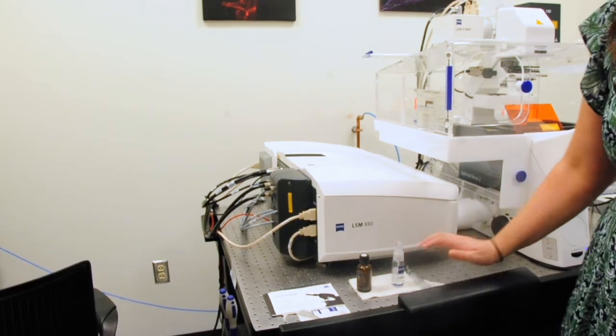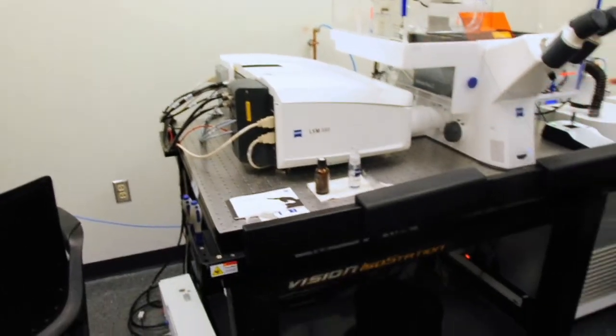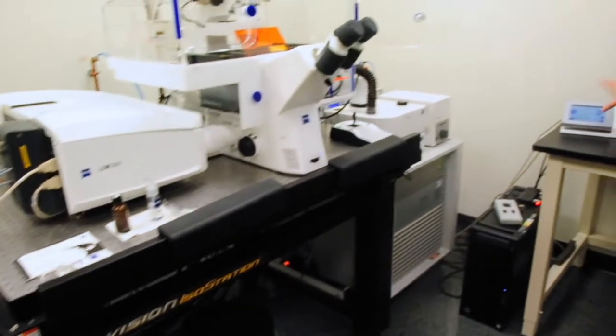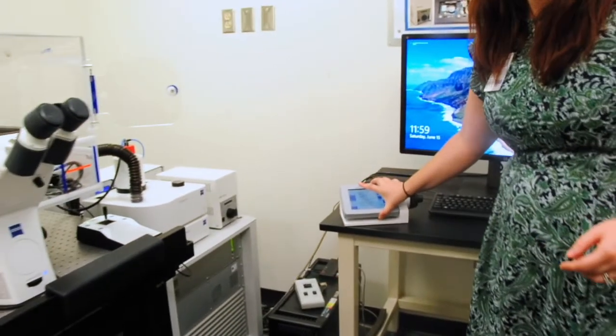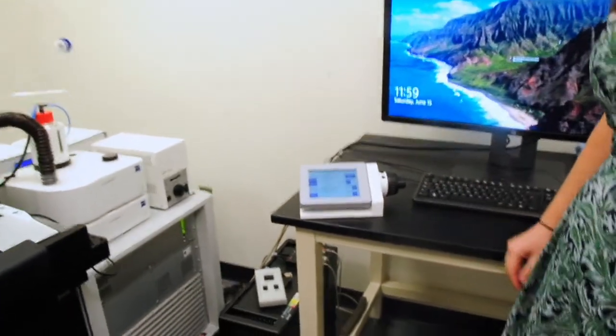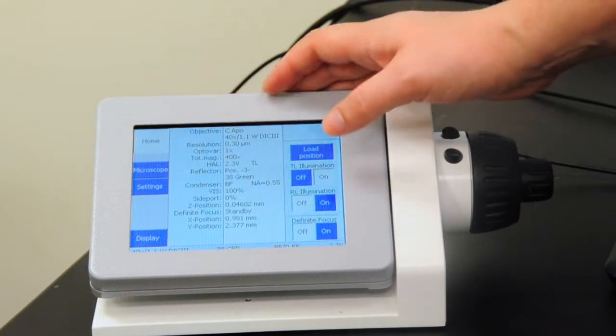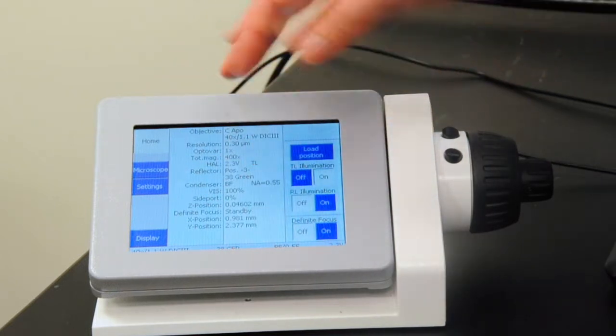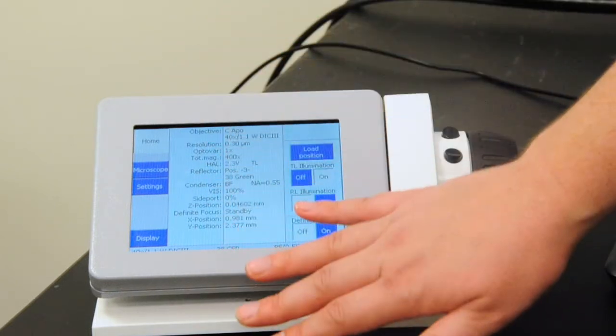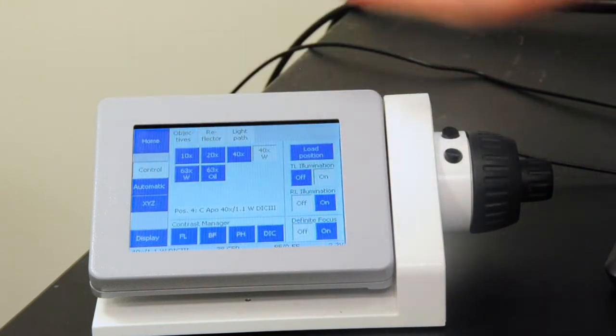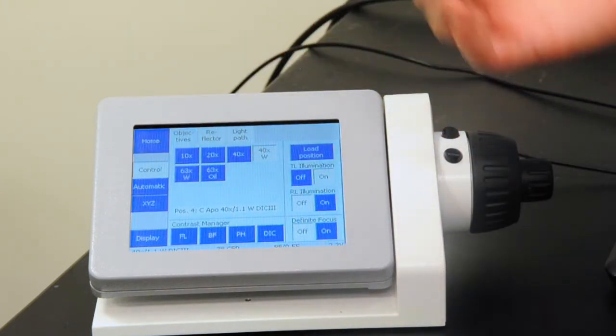And finally, if we come over here past the air table, we have a touchscreen system. Most modern microscopes will have these these days. Here we have our touchscreen that controls all the motorized parts of our microscope. In the home screen, it tells us different things about the objectives. And then we press microscope, and this is where we actually control the microscope.